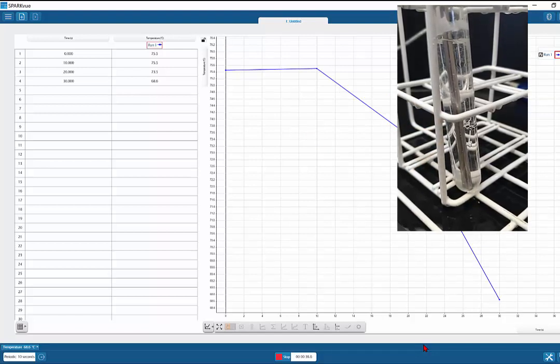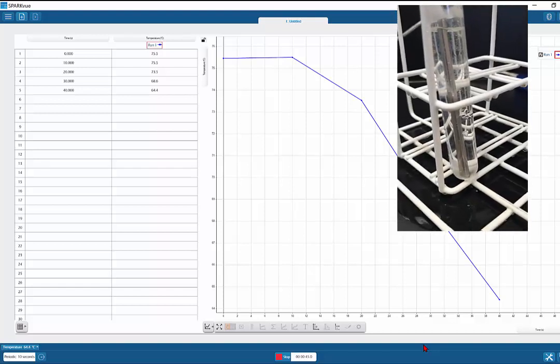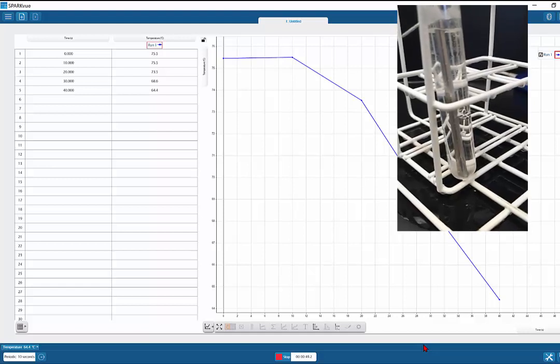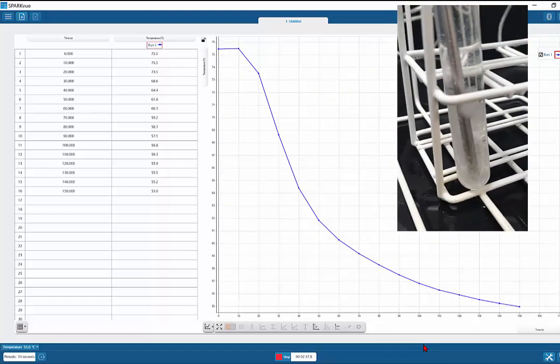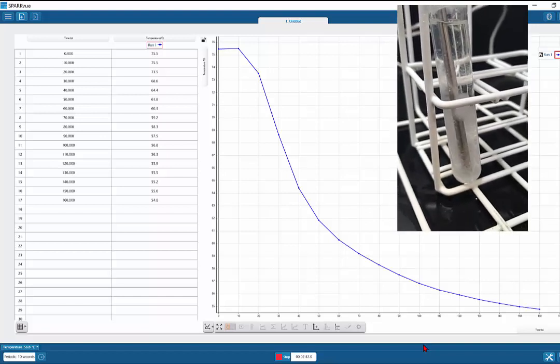So the vibrations are getting slower. And so all the energy is going into just cooling down the liquid. All right. And so that is what you get with a pure substance. You will just get these cooling curves, and at the change of state, you'll get straight lines. And so what we can see here is now you can see it's changing state. So now it is leveled out.